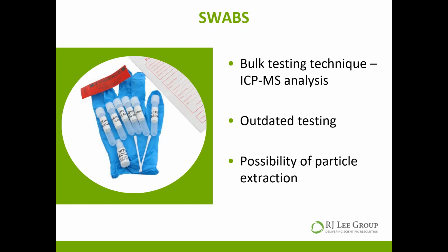It basically can tell you, if you collect with a swab, there's this much lead there, this much barium there, this much antimony there. That could be indicative of gunshot residue, but what it doesn't do is show you those three elements combined in one particle. And that's what we need to say that something is highly specific to the discharge of a firearm.